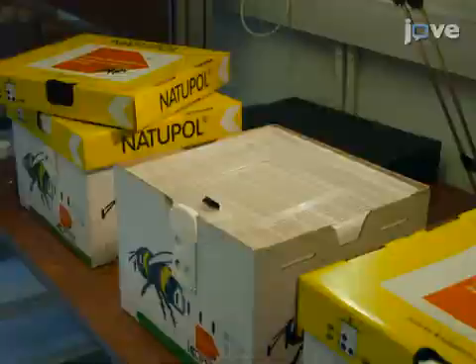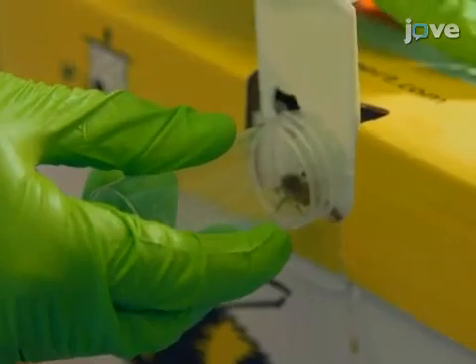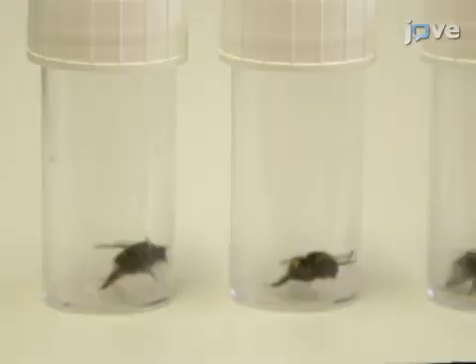This demonstration utilizes Bombus terrestris audax from commercially reared colonies. Two hours before the start of the experiment, collect individual worker bumblebees using a plastic vial with a perforated plastic stopper.